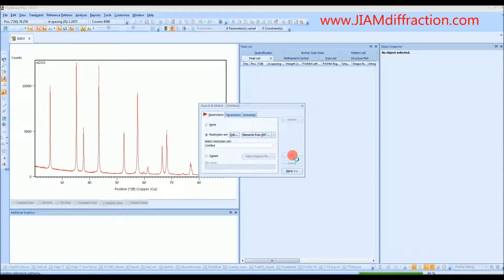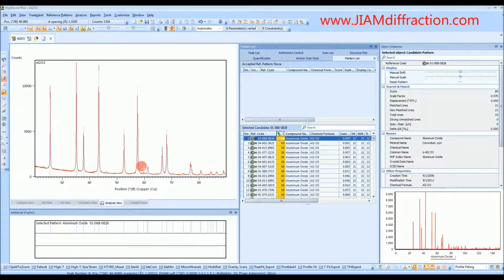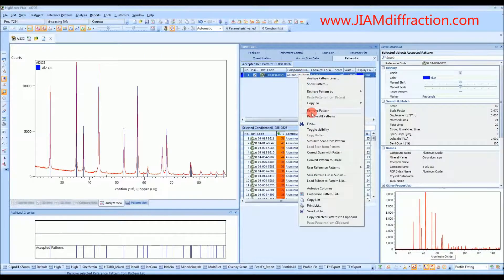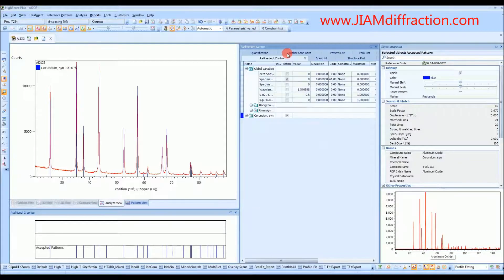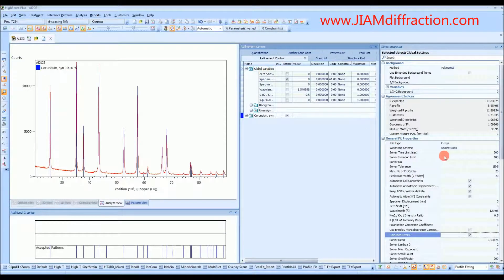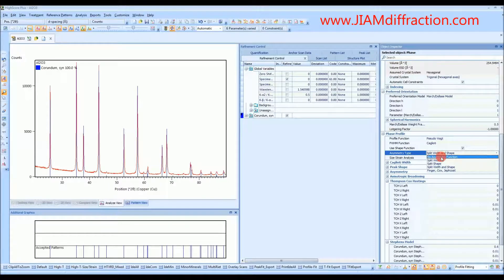We see aluminum oxide has a very high score. If we click it, the lines all match up beautifully, so we'll left-click and drag it up to accept. We'll right-click and convert pattern to phase. Under refinement control, global variables should still be set nicely — they are. Under corundum, we want to choose the same asymmetry function that we used with the silicon standard, and that is very important. You want to make sure this matches whatever standard you used. I chose split width and shape, so that's what we'll go with.